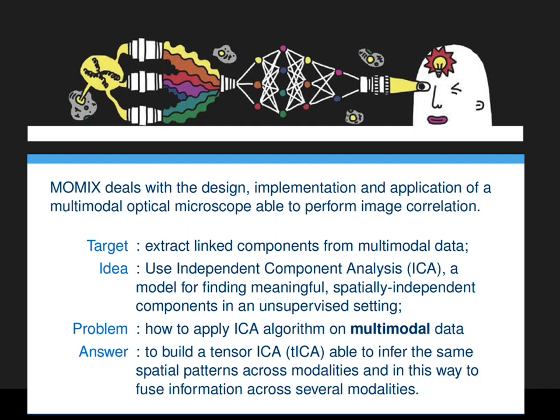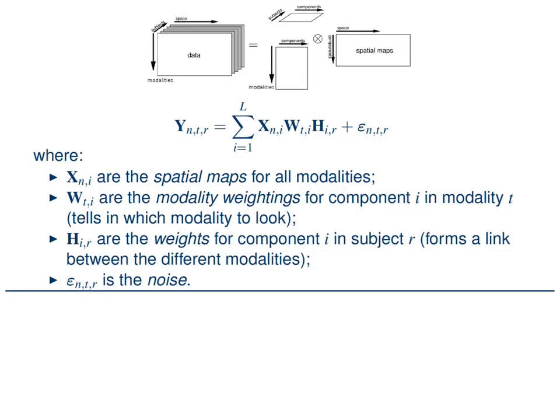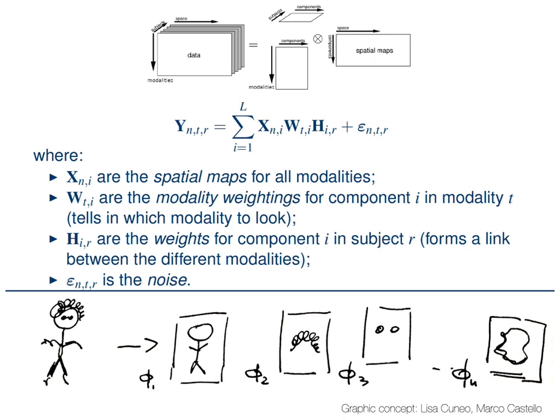But today, I think that we can use new algorithms in artificial intelligence. The one we like is called independent component analysis. And the final goal is to be able to provide a set of images with a reduced complexity in order to take decisions. So we have our images coming from all the modalities. We start assigning weights. We start extracting details, and we reduce the complexity when we recognize something in the life of the cell with respect to other things that allows you to transform our microscope into an intelligent microscope.